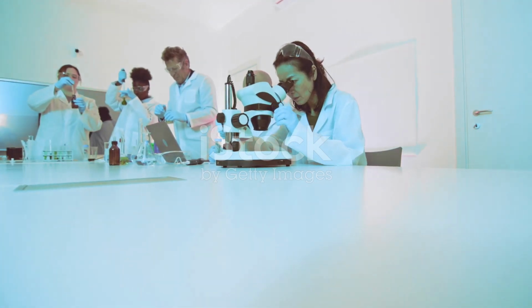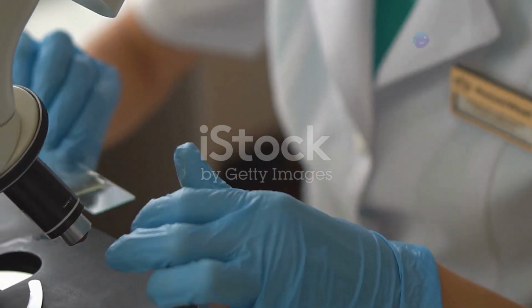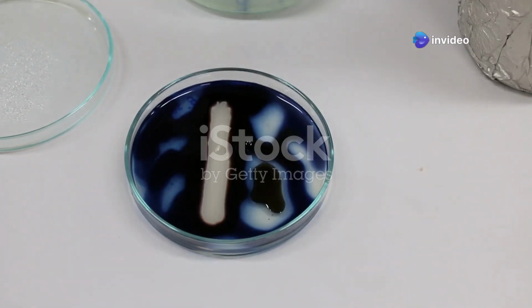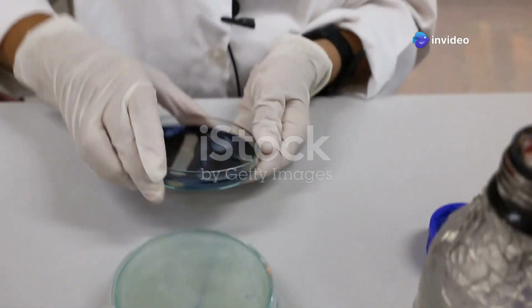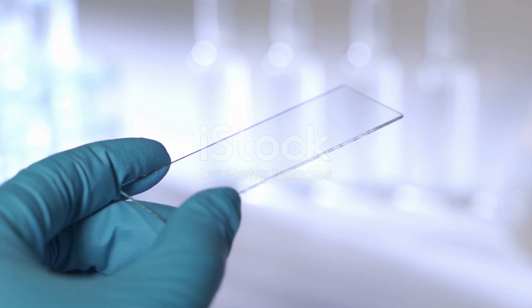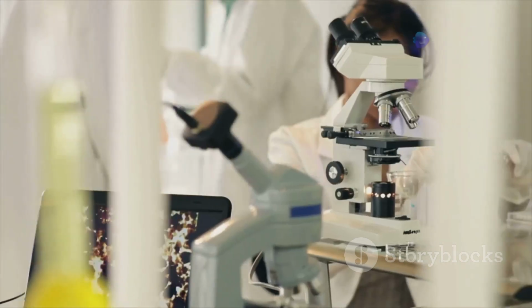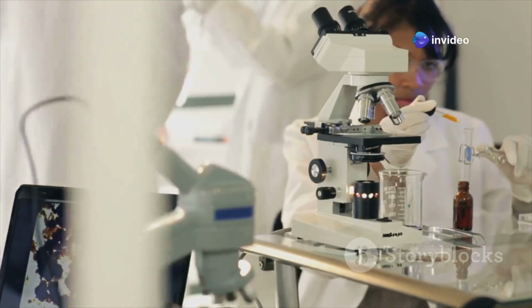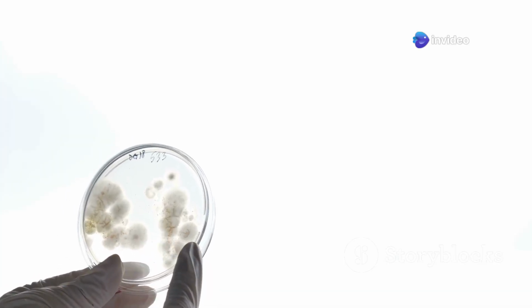Now that we've met our star players, let's get down to business. The first step in gram staining is preparing a bacterial smear. Imagine spreading a thin layer of peanut butter on a slice of bread. That's kind of what we're doing here, but with bacteria instead of peanut butter. We take a tiny drop of our bacterial culture and spread it thinly on a clean glass slide. This ensures that we have a single layer of bacteria to observe under the microscope. It wouldn't be much fun if they were all piled on top of each other.